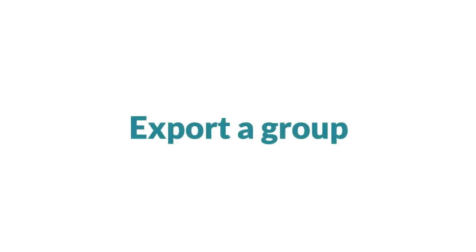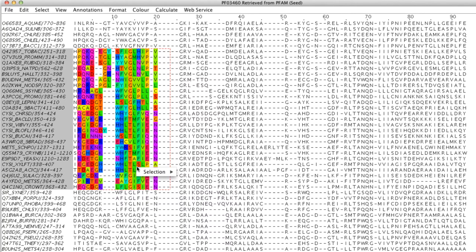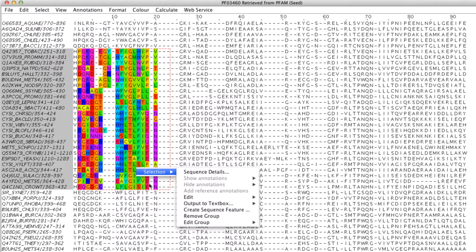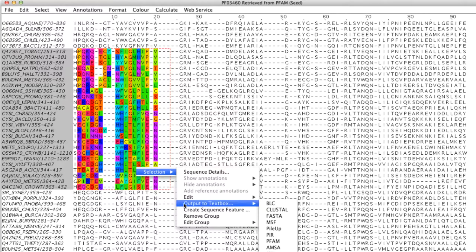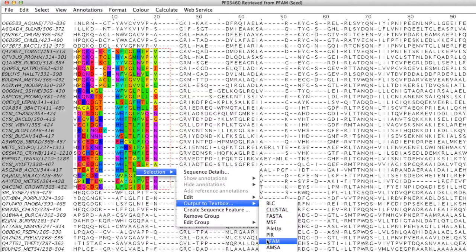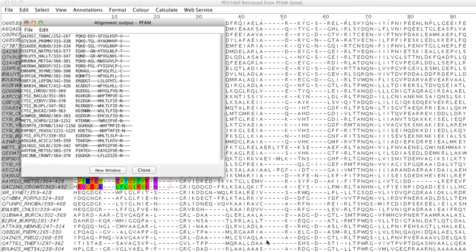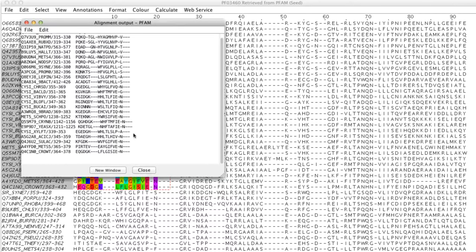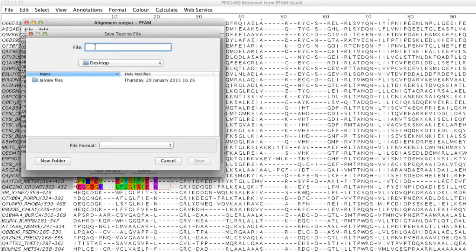A group can be exported or copied into the clipboard. In the selection menu I go to output to text box. There is a range of file formats to choose from. An alignment output window then opens and I click save. Then in the folder I type the file name and I click save.